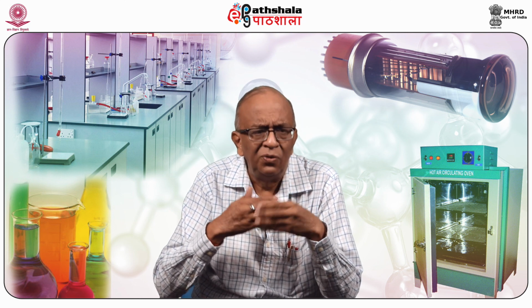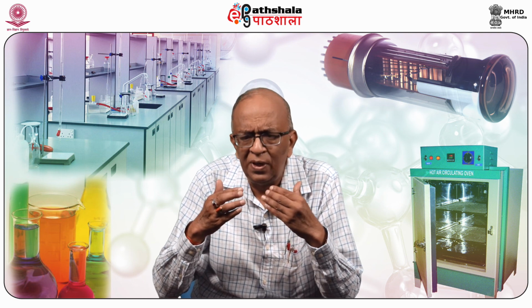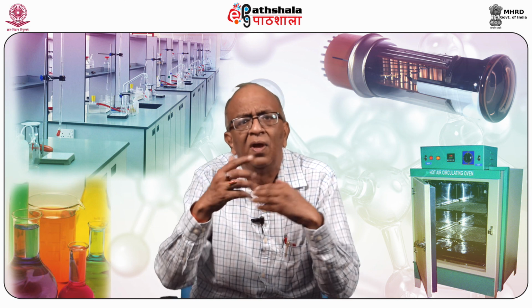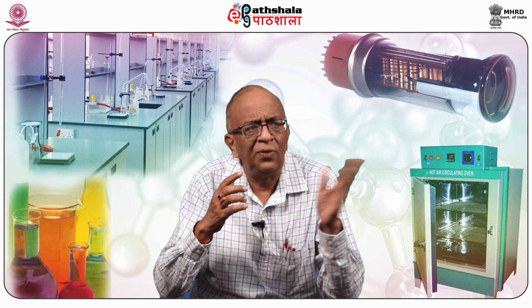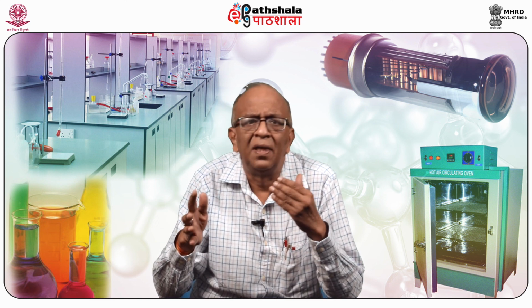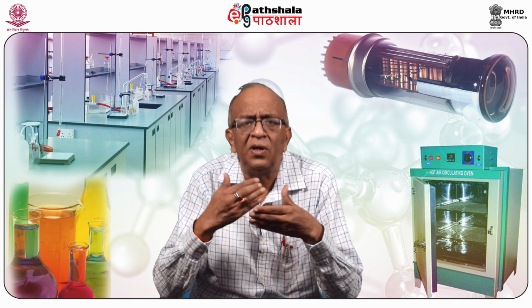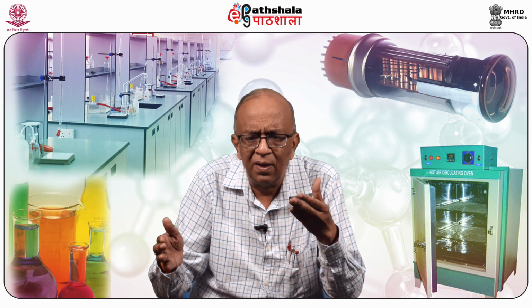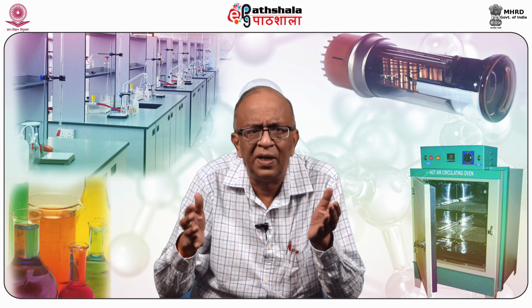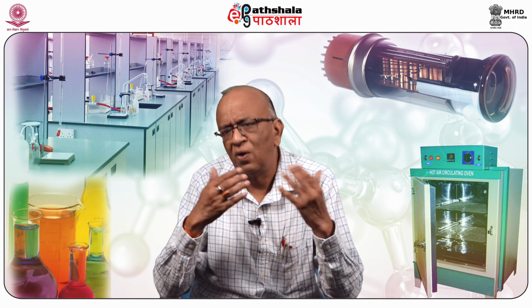So putting the instrument in place in an industry so that it can be directly interfaced with the process taking place in the different types of industrial reactors, and then transferring the compounds, the synthetic products, at every stage to the process analyzers, is very important. Then after transfer, at every stage results are obtained.